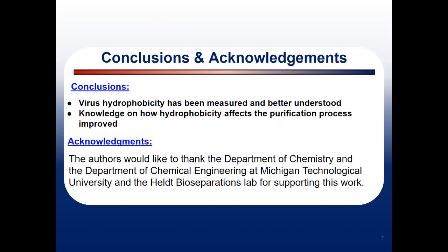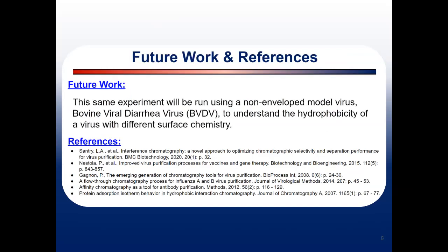In the future, this experiment will be run using a non-enveloped virus, bovine viral diarrhea virus, or BVDV. This will allow the hydrophobicity of a virus with a different surface chemistry to be analyzed.